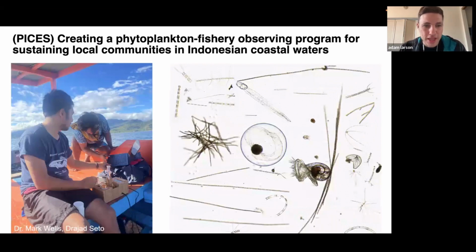And so what we were able to do is take, in one transect, the PlanktonScope on one of these boats and train a lot of the fishermen that are actually out there, and have them take images and upload these images in a few days. So you can enable people that are actually on the water to take charge of these projects and form their own initiatives looking for these things which really devastate the communities.